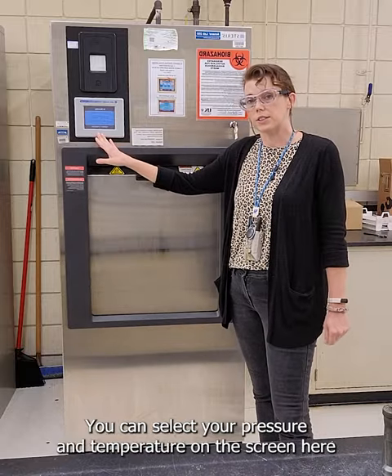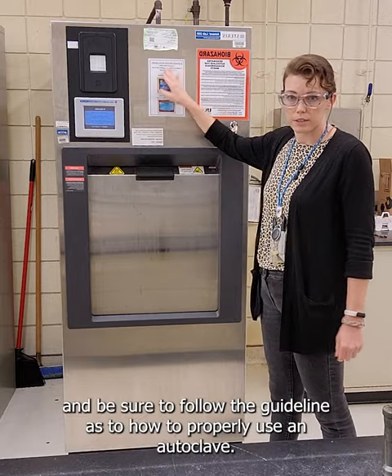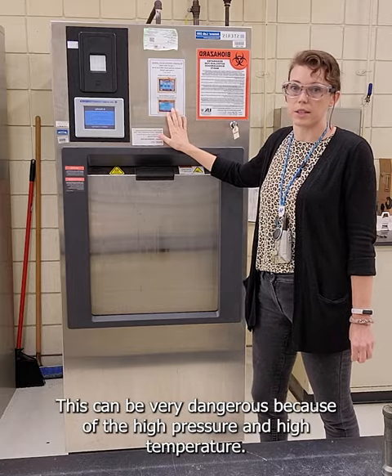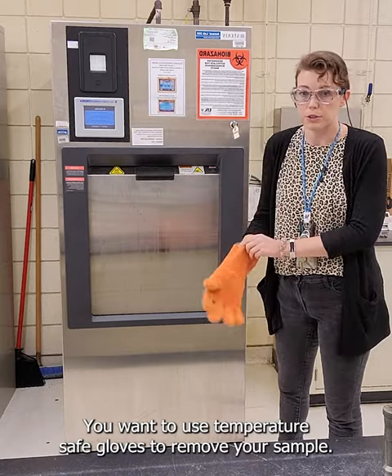You can select your pressure and temperature on the screen here, and be sure to follow the guidelines as to how to properly use an autoclave. This can be very dangerous because of the high pressure and high temperature. You want to use temperature-safe gloves to remove your sample.